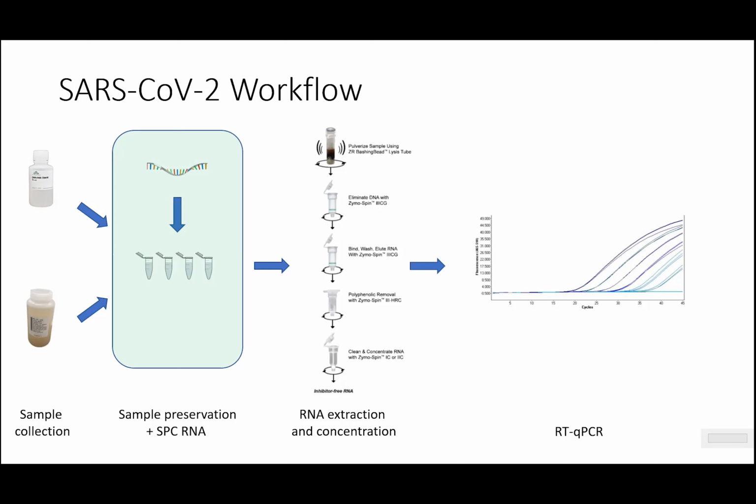We have also evaluated OC43 coronavirus as a sample processing control, and in our hands, it performs similar to the in vitro transcribed RNA with this method. Now, as I stated a little bit before, wastewater by nature is a complex and dynamic matrix, which can lead to increased variation, especially when using molecular methods. Replicate analysis can help to mitigate the variability associated with wastewater. This is the approach that we take. Each of our samples is extracted a minimum of 3 times, along with a mock extraction control to control for cross-contamination.